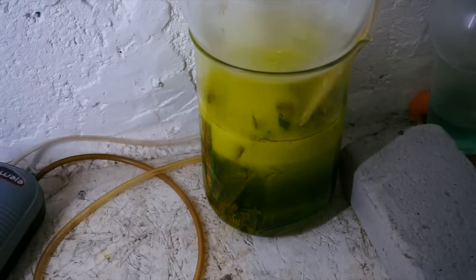As the solution heats up, the hydrogen peroxide will start reacting more vigorously. Bubbling air through the solution will help subside the foaming and will keep the solution well mixed.